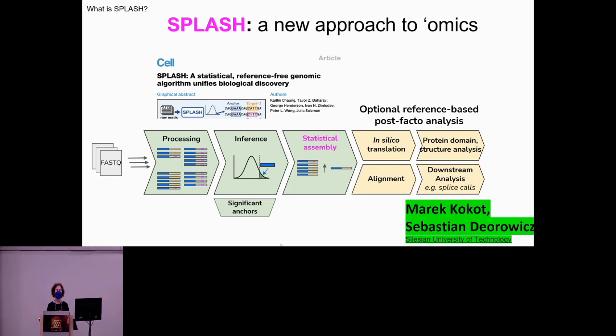So you can also view SPLASH as simply an ultra-efficient statistical preprocessor, where you would take your raw reads, run SPLASH, and essentially switch out SPLASH's calls instead of the raw reads, and then do whatever task in custom bioinformatics you were doing today.